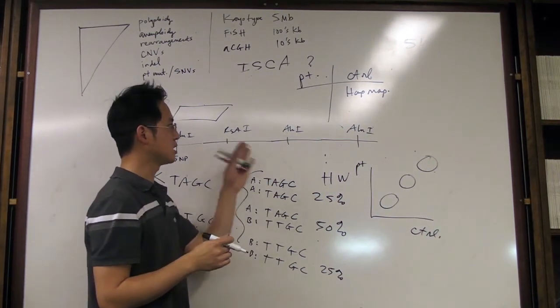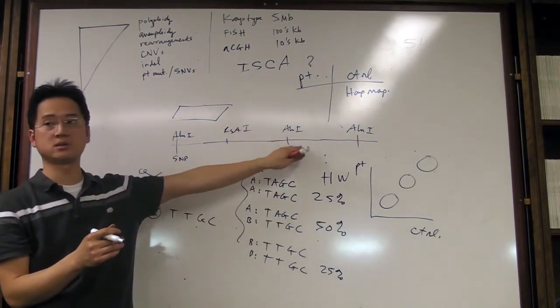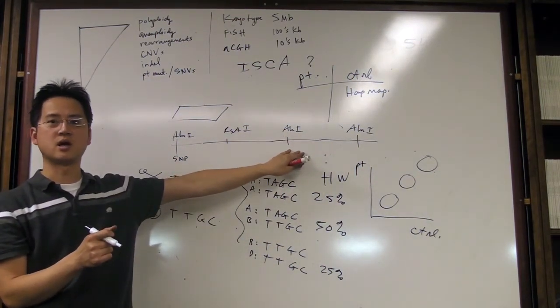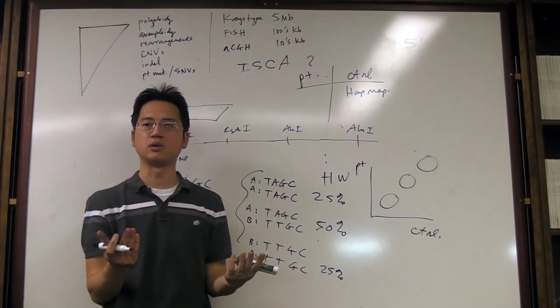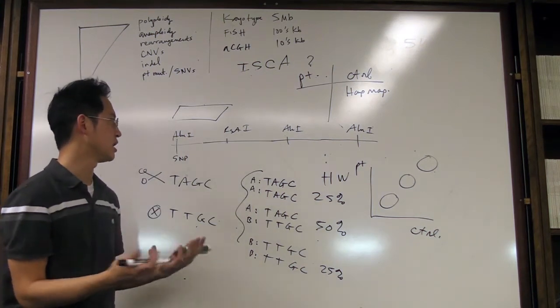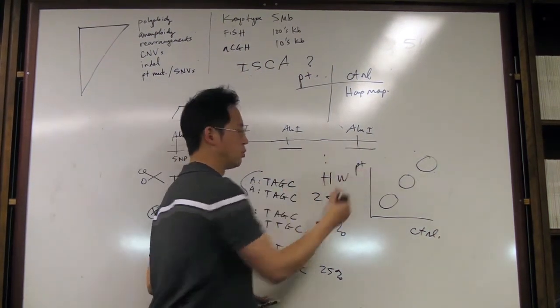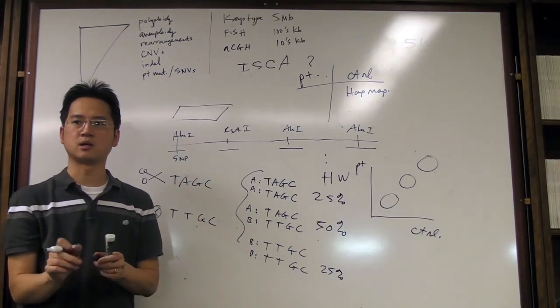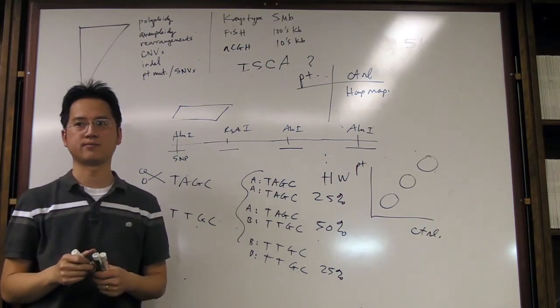And the reason why I say it's clever is because already the assay that Agilent performs already requires this digestion step. And they didn't change anything about hybridization, didn't change anything about labeling. I guess hybridization did change because they designed probes to sit right here. That will give you the differential kind of binding and hybridization. But otherwise, everything, the core principle of the assay is the same.